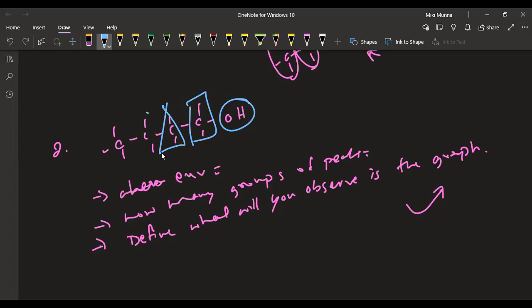Same goes for this one. Towards its left, CH3. Towards its right, it's CH2, CH2, and so OH. That means now two more CH2 have come, so this is another unique part. And finally, we have the CH3 towards the very left, and another CH3 which we have here.